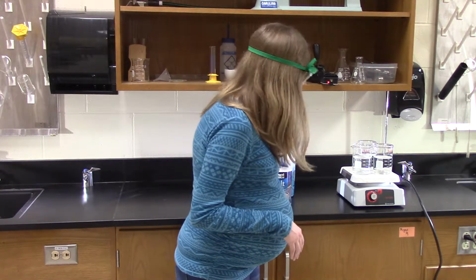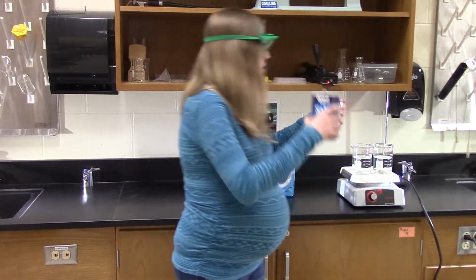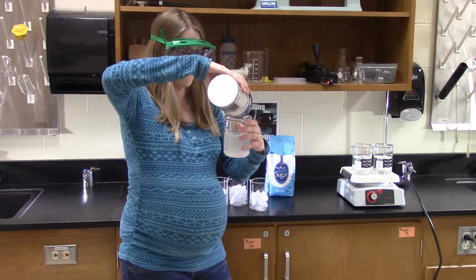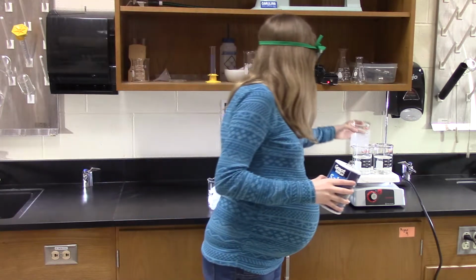One's labeled water, the other one is labeled salt, so I'm just going to pour some salt into this one. Just kind of eyeball it. I want to put definitely enough that we'll see an effect. So that seems good.